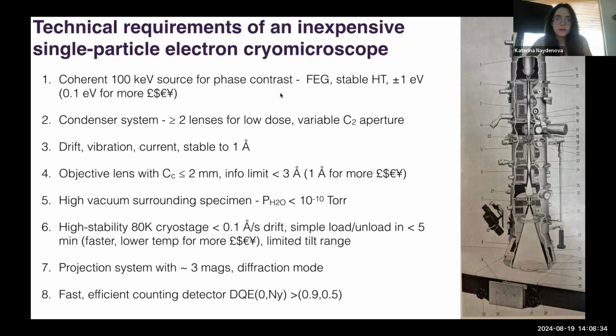For single particle cryo-EM, we don't really need the large tilt range of the stage. That actually simplifies the design. And crucially, we need a small objective lens with a good information limit and a rather low chromatic aberration, which we're going to talk about later.